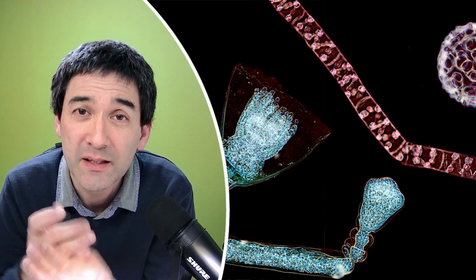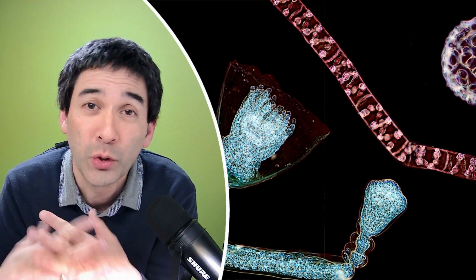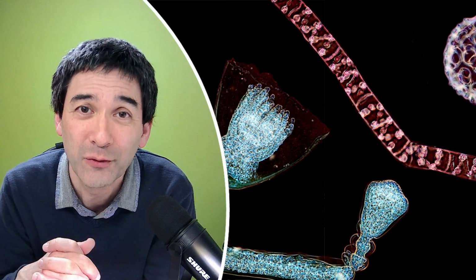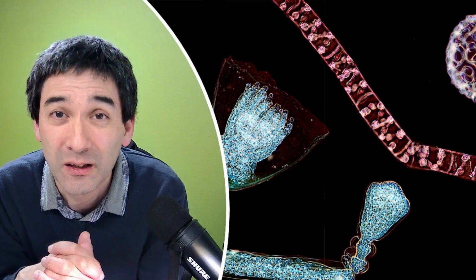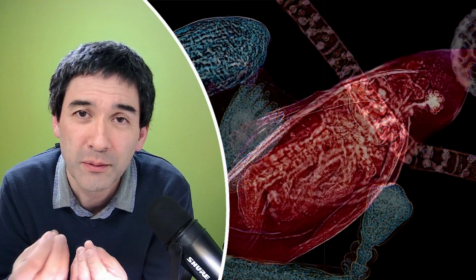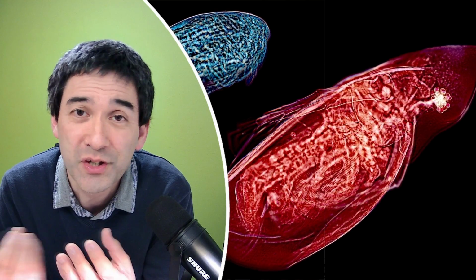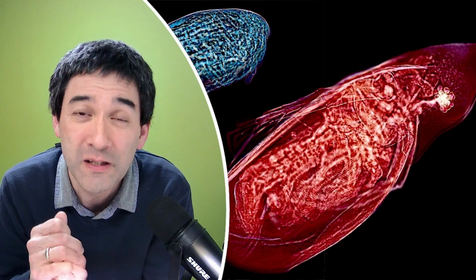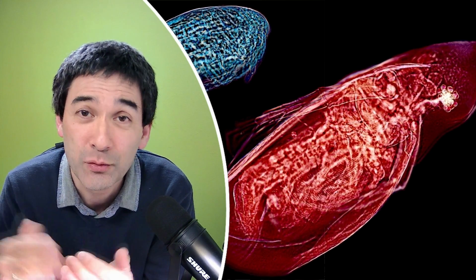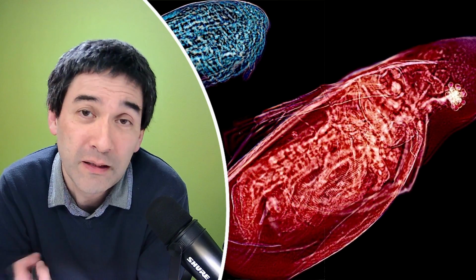I simply soak everything in hot water for several minutes. The hot water will, of course, also kill a lot of microorganisms that might still be on there, but it will also dissolve everything that causes the cover glass to stick to the microscope slide. And in most cases, the cover glass and the slide will separate completely on their own.